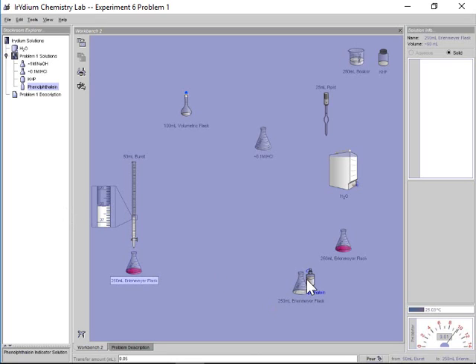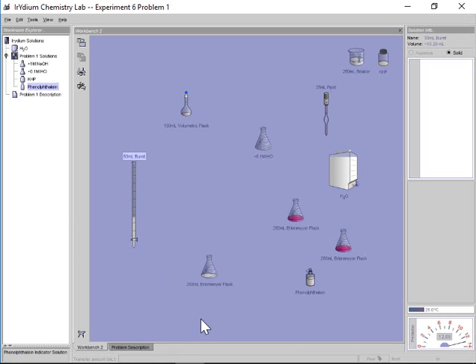If I have enough solution, I'm going to definitely test this last one anyways while I have it. I do need to unload my burette. Remember, it's okay to refill your burette, no problem. Sort of not in a titration. You just can't do it while you're doing the titration. That's why you say you want to make sure you have somewhat more than half. I have about 14 mils in here because the 15 mils is marked down there.